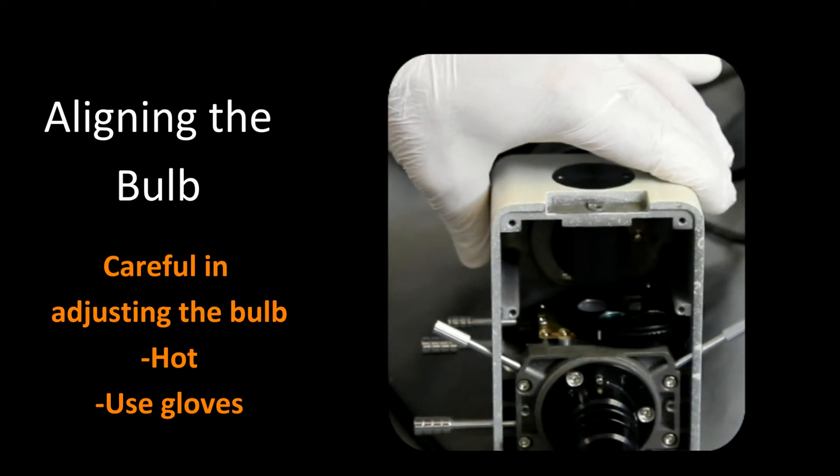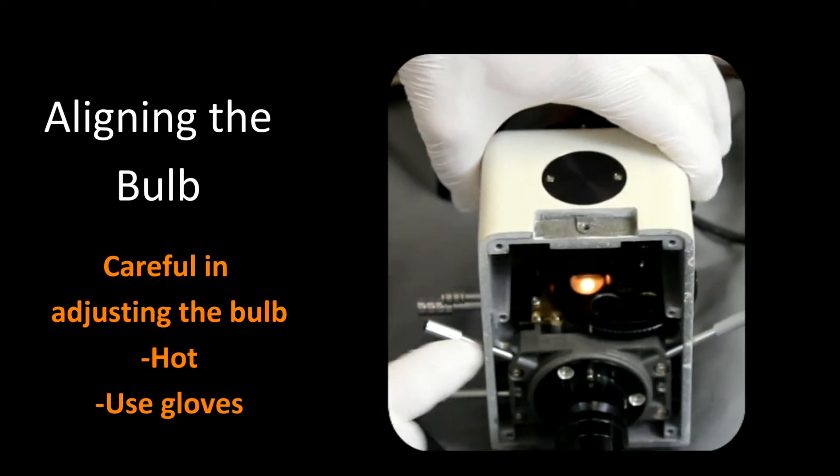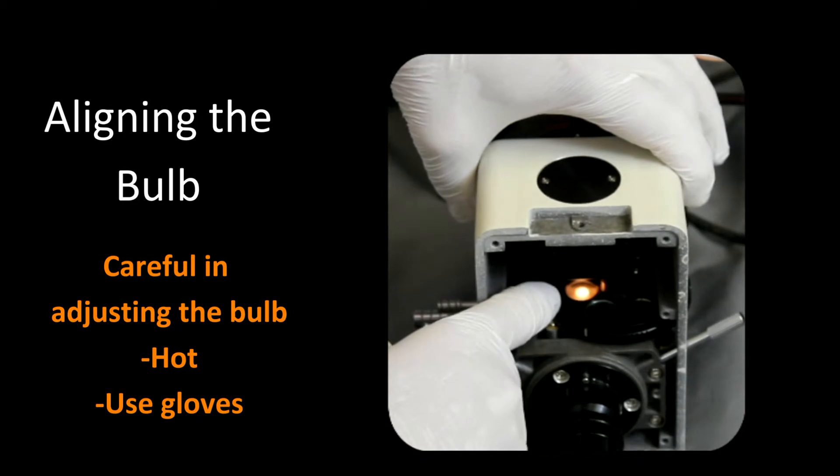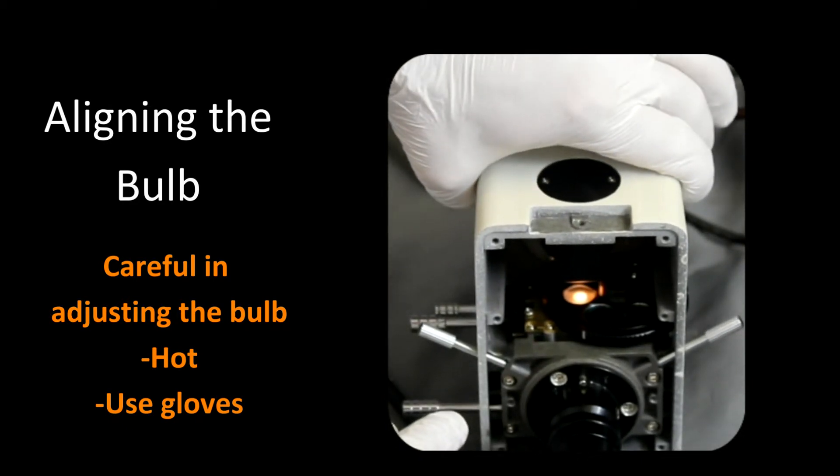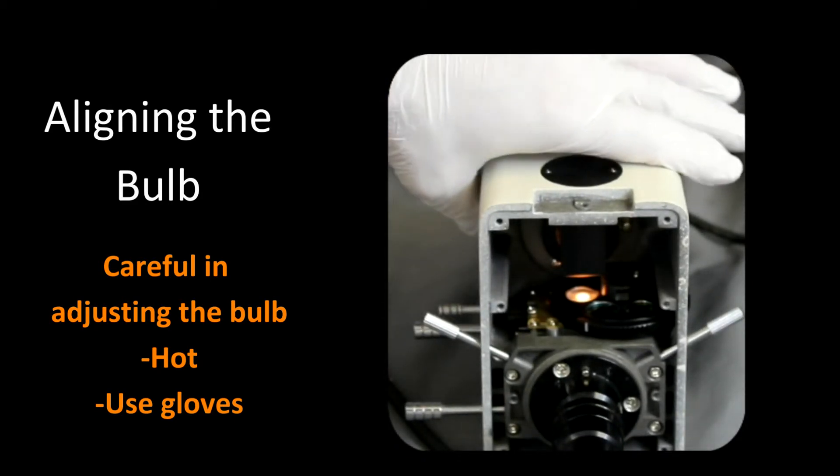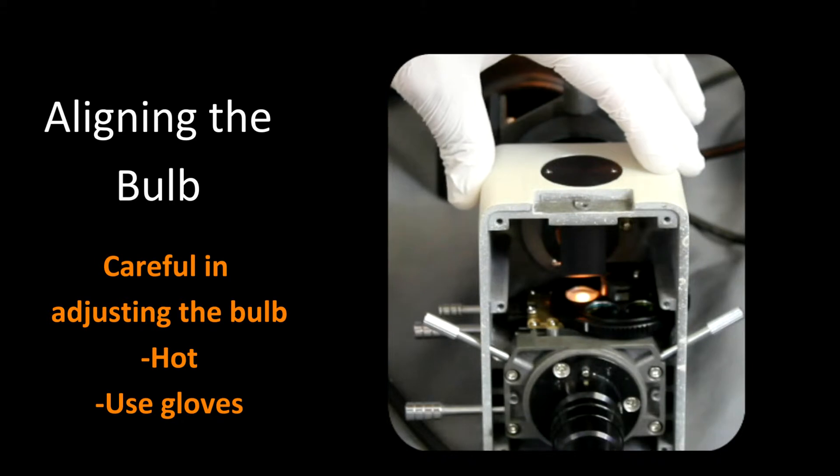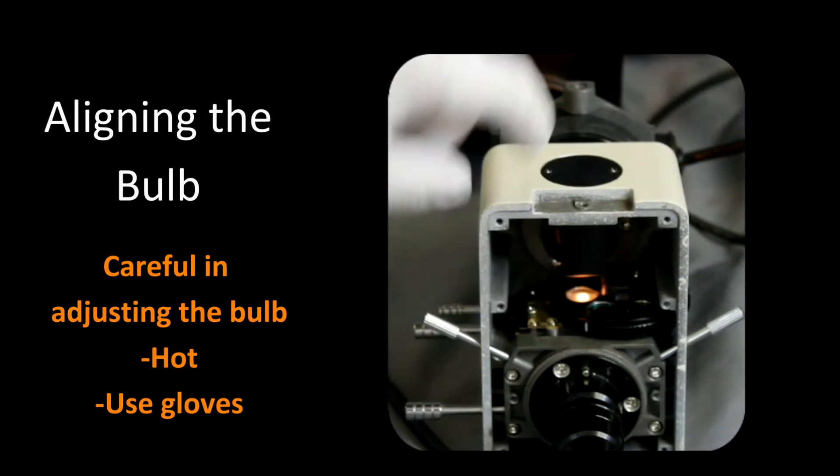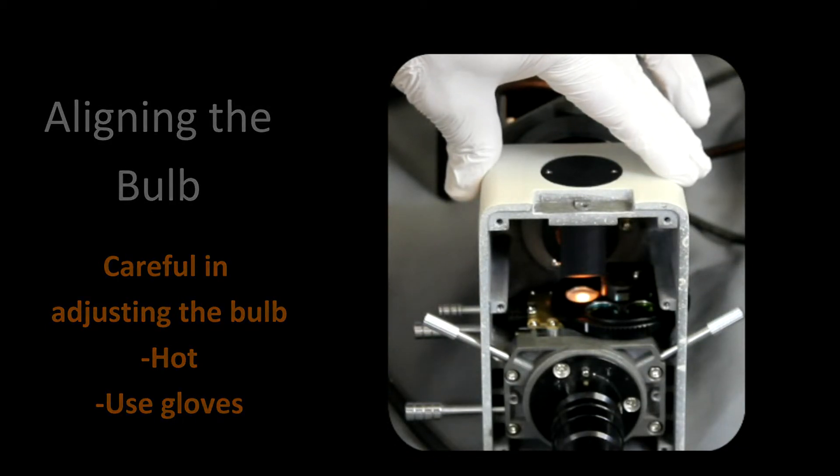And what we want to do with the light on low intensity, you can see we have the ground glass slide in place with a ground glass filter in place. And we want to make sure that the light is centered on that. If it's not centered at the low intensity, you should be able to touch the bulb for a few seconds. But what you want to do is you want to rotate that or align that so that this is lined up pretty much in the center. That would give us the optimum light bulb adjustment going into the system.